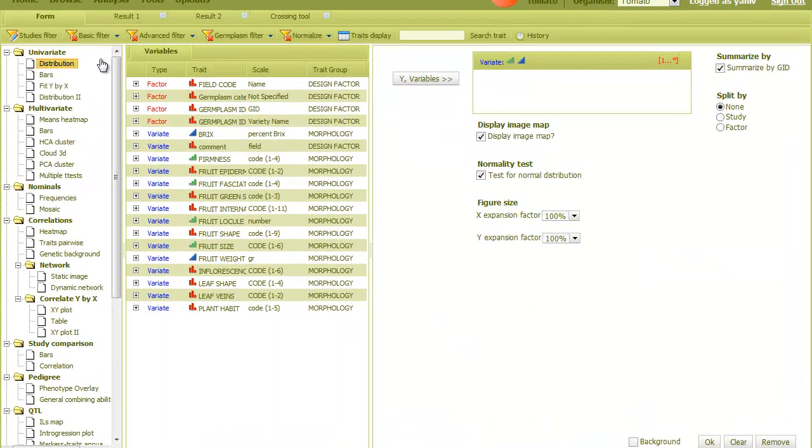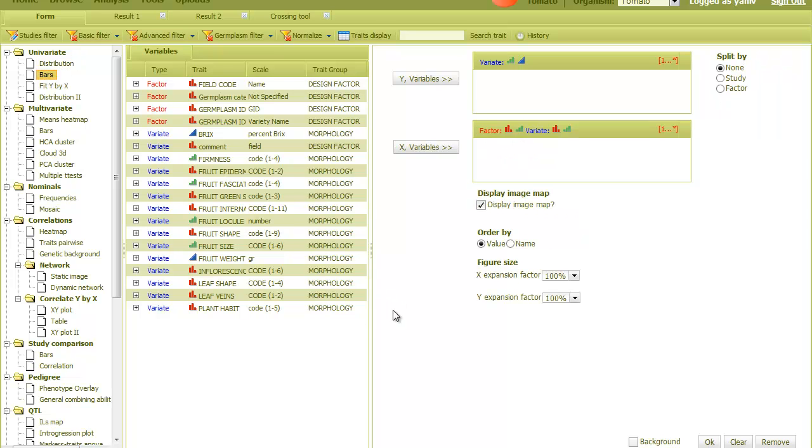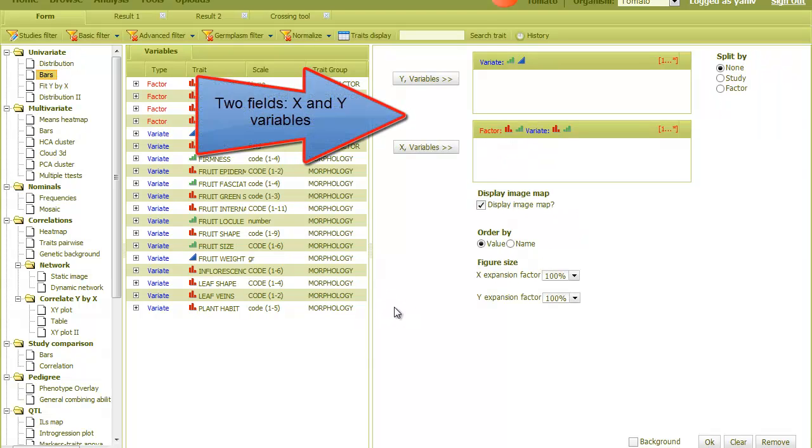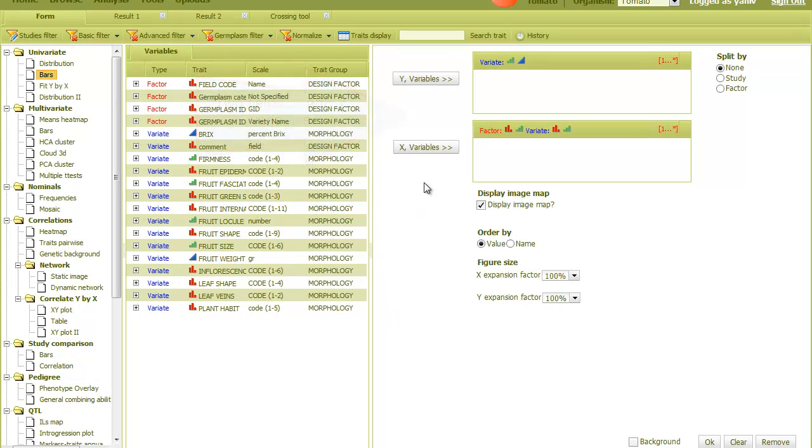Now I'll select the next analysis, which is bars. Here we have two fields in the form. I'll put some nominal traits, represented by the red icon, in the X field. Let's take this one.